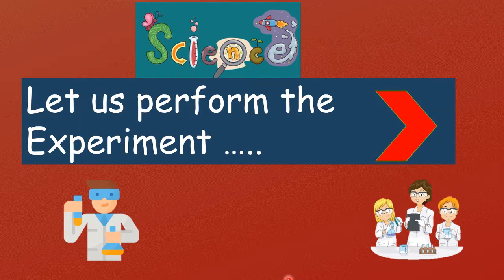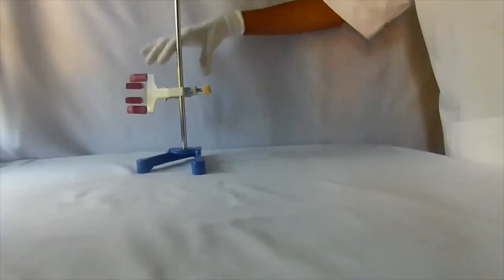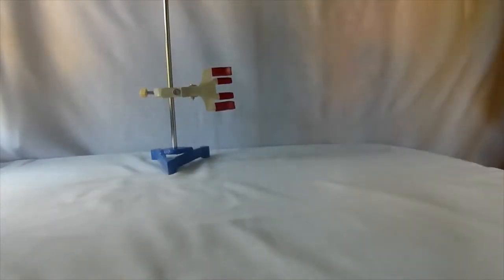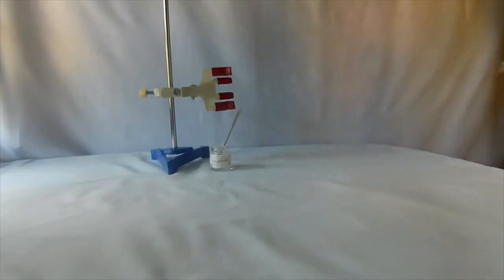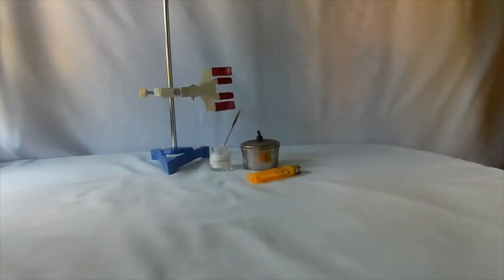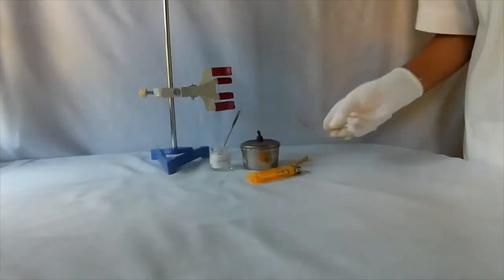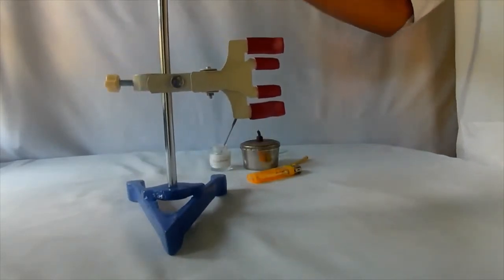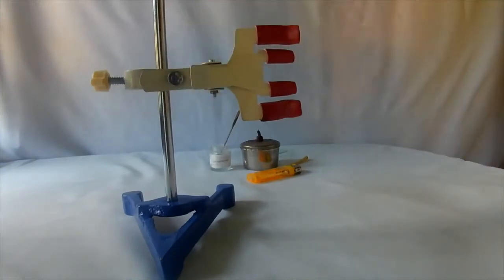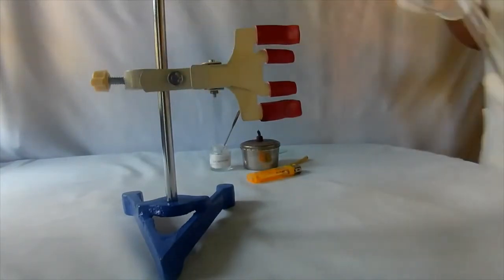I hope you are all ready. Let us perform the experiment. Take an iron stand, zinc carbonate salt, spirit lamp, lighter, a wooden splinter, moist blue litmus paper, and a test tube.